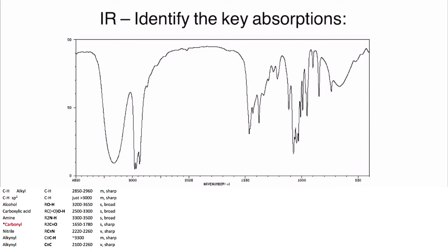In the next spectrum, peaks near 0% transmittance or 100% absorbance are key. Here is a strong broad peak. We would expect this to be an OH or an NH, an acidic proton.